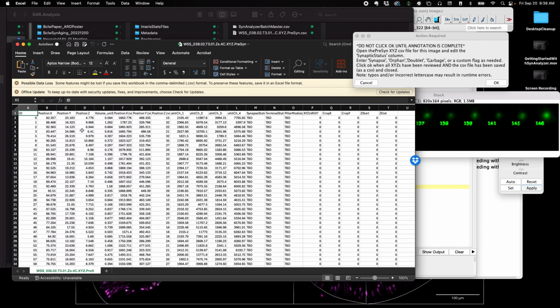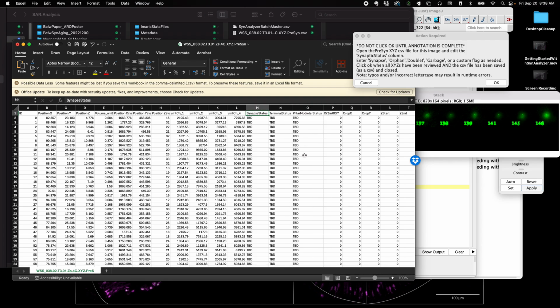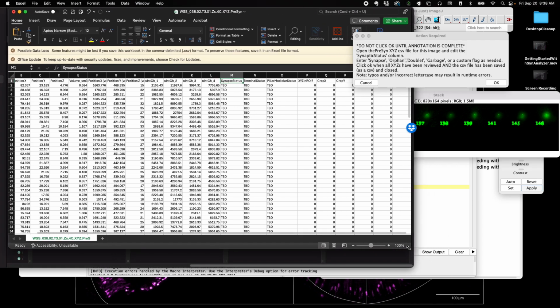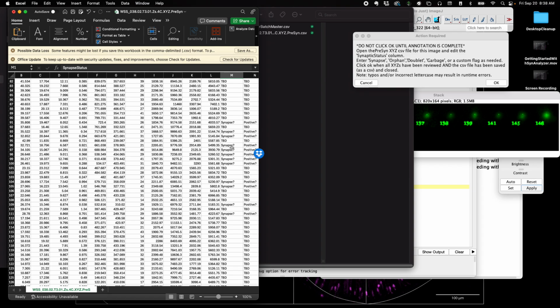And now what we're adding to it is the status, right? So is it a synapse? That's the main thing that we're doing right now. That's the manual part. The pillar modiolar status part, that's going to be automatic. So it has all of that previous information, but now it also has new columns. And so what you're doing in this step of the analysis is you're looking at this array and you're determining whether or not these puncta is it a synapse?